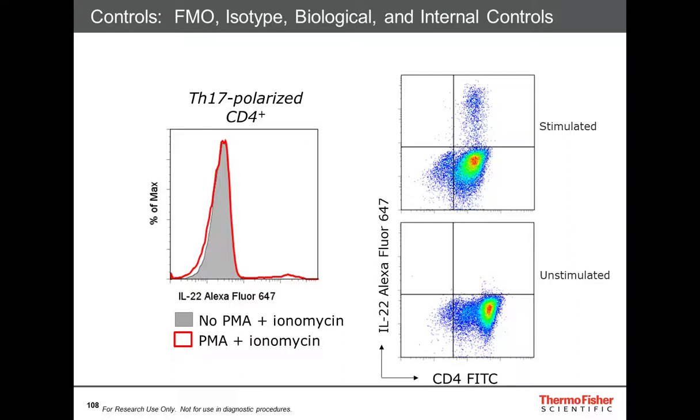So here again, you have controls based on what you're going to do to your cells. If you make changes, or if you treat cells with radiation, or you stimulate them, or you kill them, or there's something that you do to your cells that creates a change in your cells, there may be changes that affect your fluorescence, that affect your scatter, that affect the stickiness. So you want to do as many controls as you can, especially in the beginning of an experiment, so that you can see any of these changes that might occur.